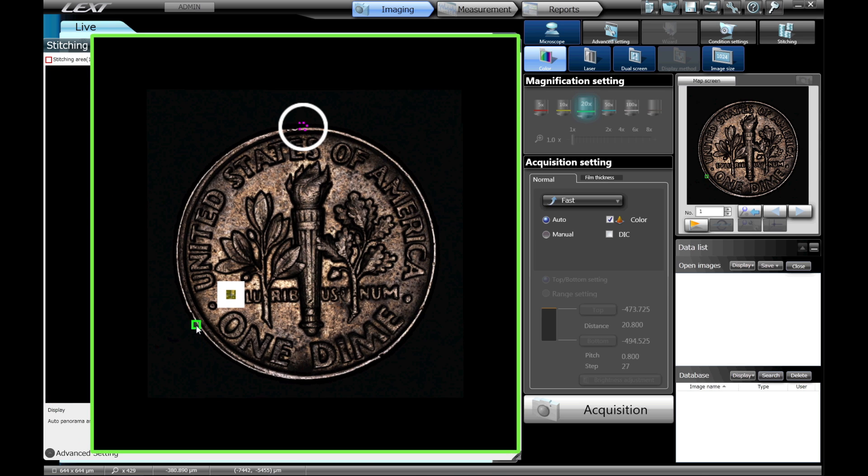Even when the sample has a complex shape, just select the necessary image range to acquire the image in a short time.